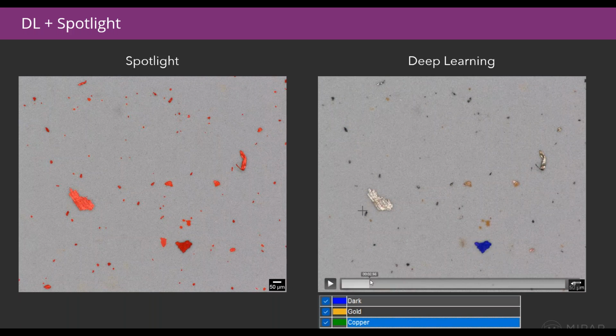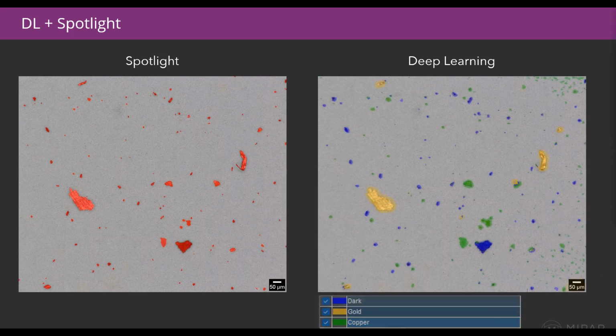So we can use Snap to come in here and allow rapid selection of various of the features in the different classes using this box mode, where we can select features across as many classes as we'd like to train. Again, this permits not only a lot of speed, but precise boundary outlines, which result in high quality models. So once the annotations are made, then we can train the model. And when you apply it to the rest of the image, this is the result that we get.